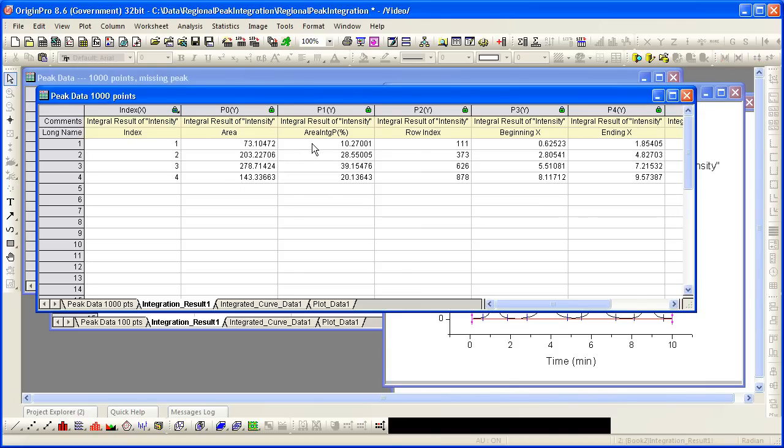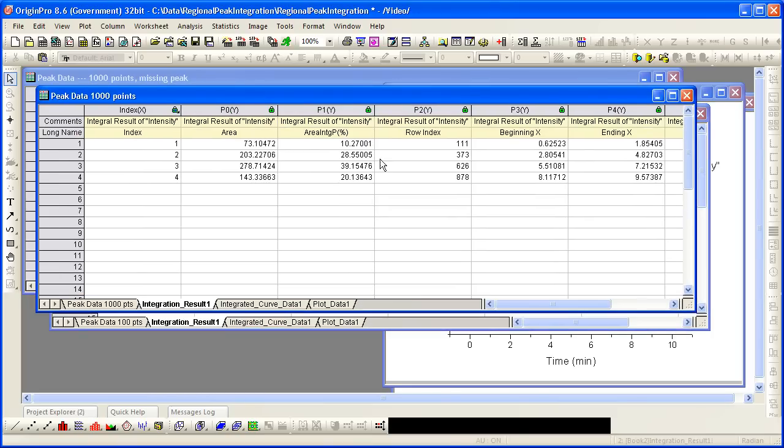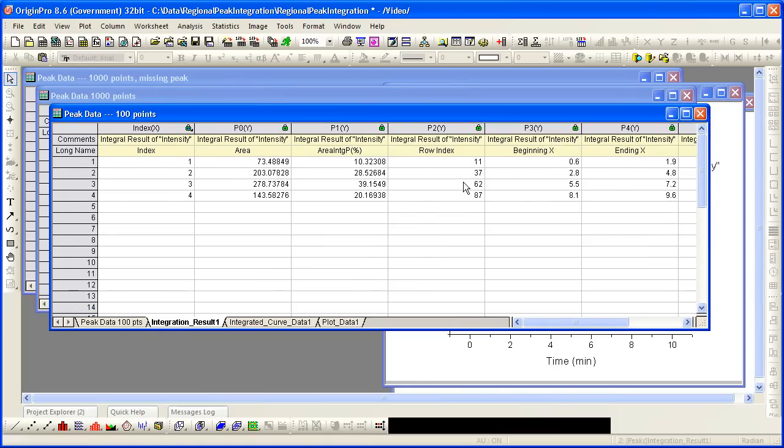You can see from the result again there are four peak areas. Those areas are the same as previous which makes sense. It's the same x and y but a different number of x points. But the row index now is about ten times that, these four values of the previous values, which we'd expect because now we have ten times as many x points.